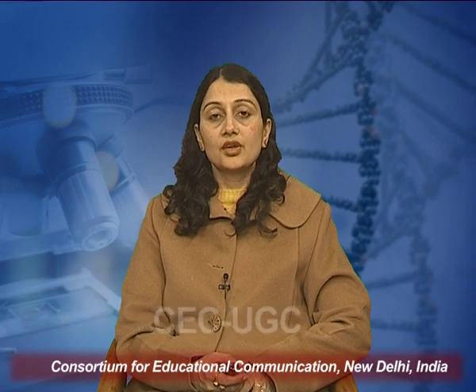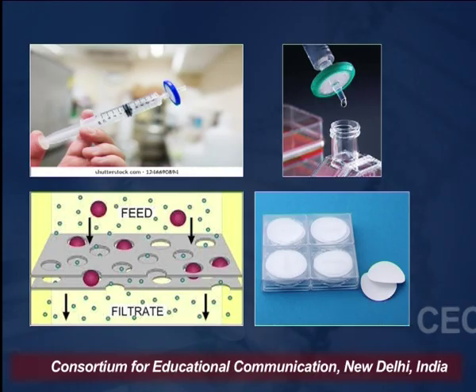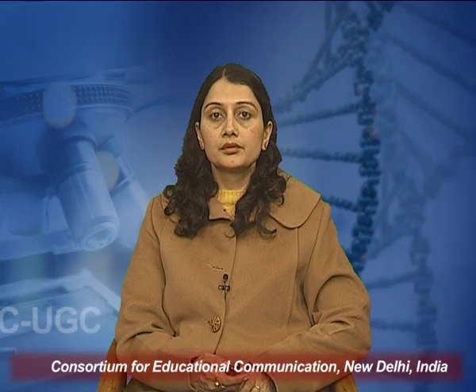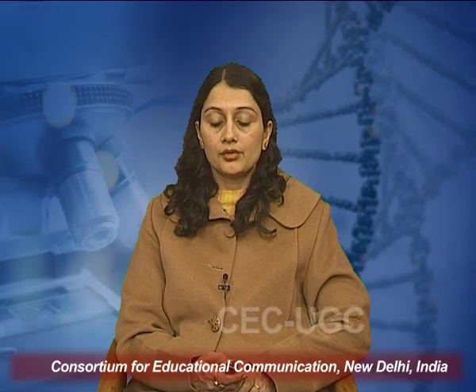The top picture shows the syringe filter. It is a smaller filter, and you can see the larger molecules cannot pass through it, but the smaller ones pass, and hence the filters can be used. This is the common HEPA filter which we use. It has the steel wool and the glass wool.